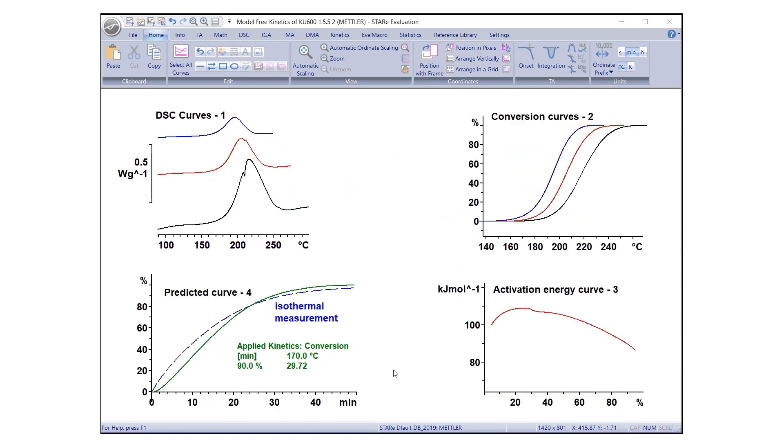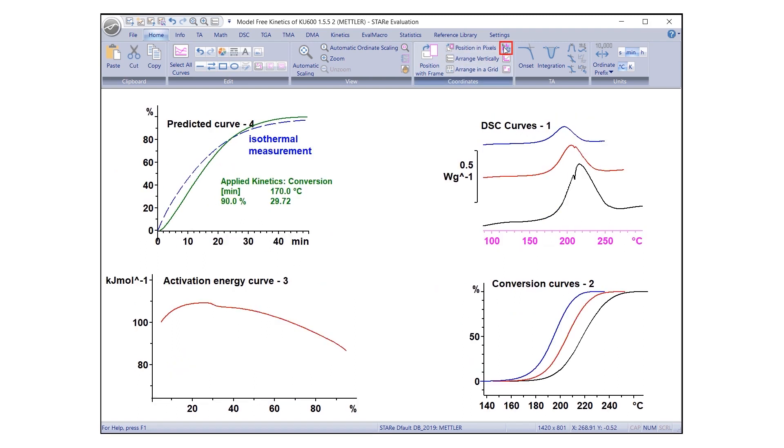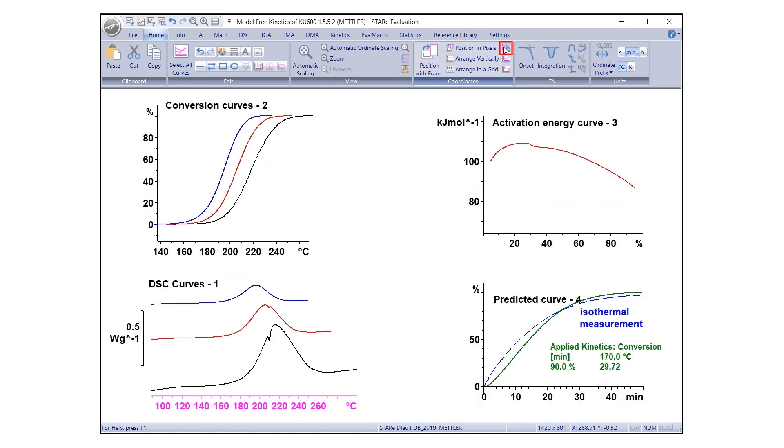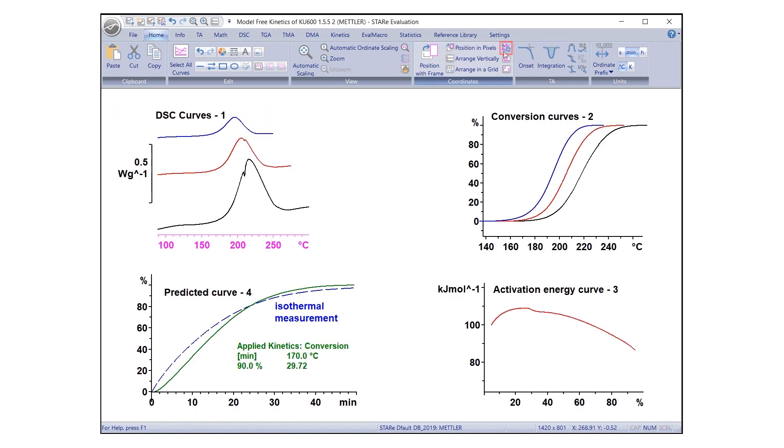The Switch option allows you to determine the order in which the curves are plotted in the evaluation window. First, select the coordinate systems you would like to move, and click Switch under the Home tab. If the coordinate systems are arranged in a grid pattern, their positions get rotated in a clockwise direction.